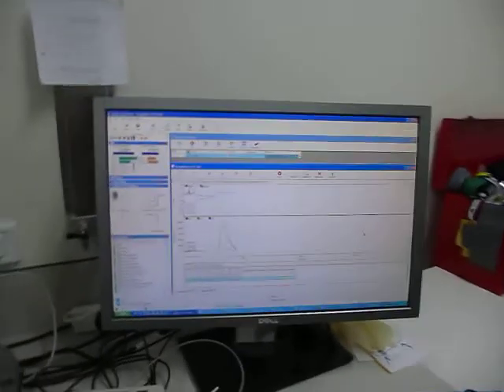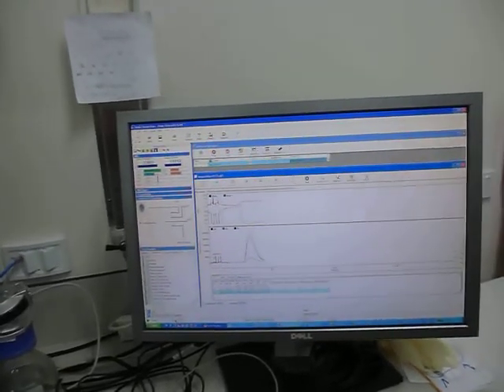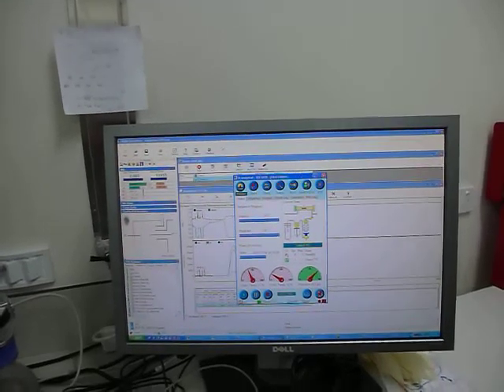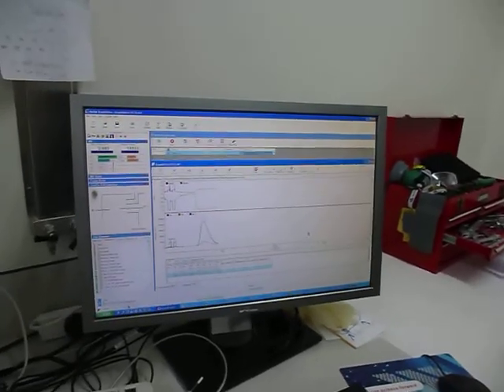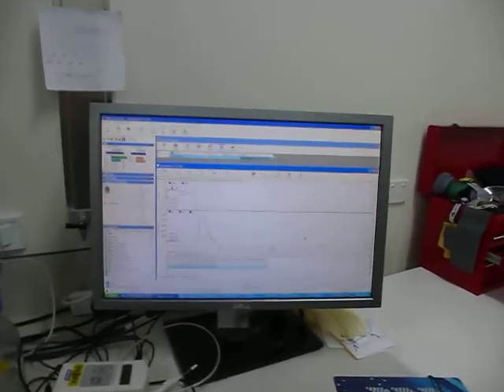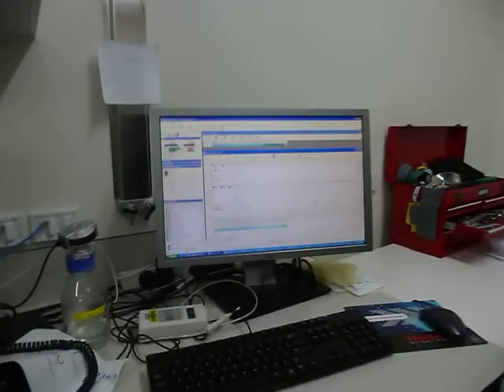So you see the peak. It's a big peak. It's working. It's very good. I'll just leave it going for a while so you can see the next peak. It will take some time, okay? It will be some more 7 minutes or so. In the meantime, I can talk about the process here again.